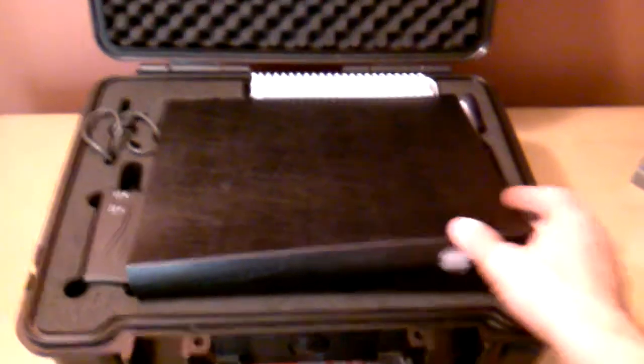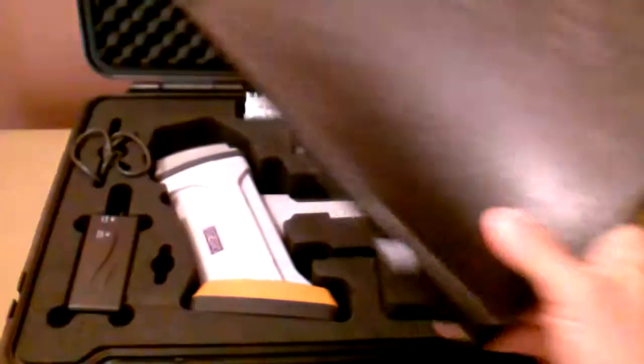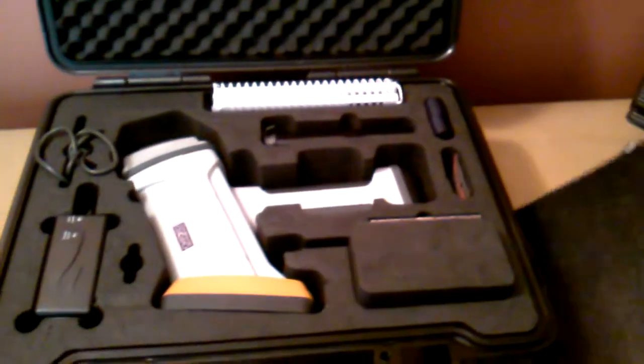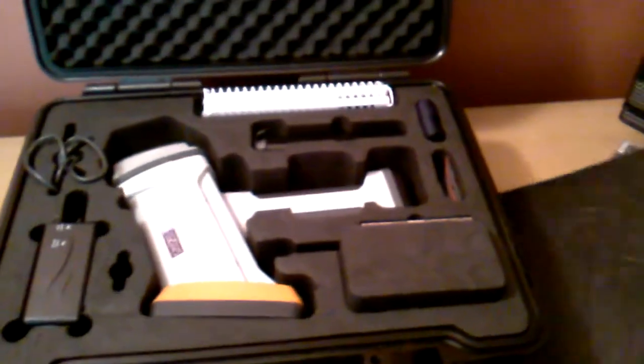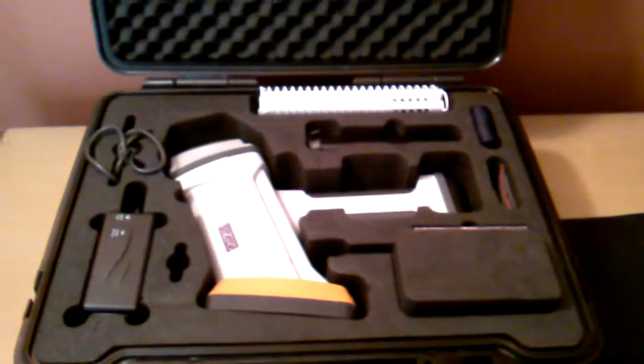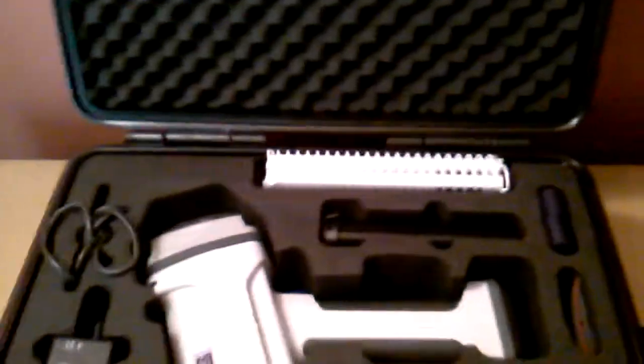Open up the good sturdy carrying case, take a look at what's in there. Information on the system itself and specifications.